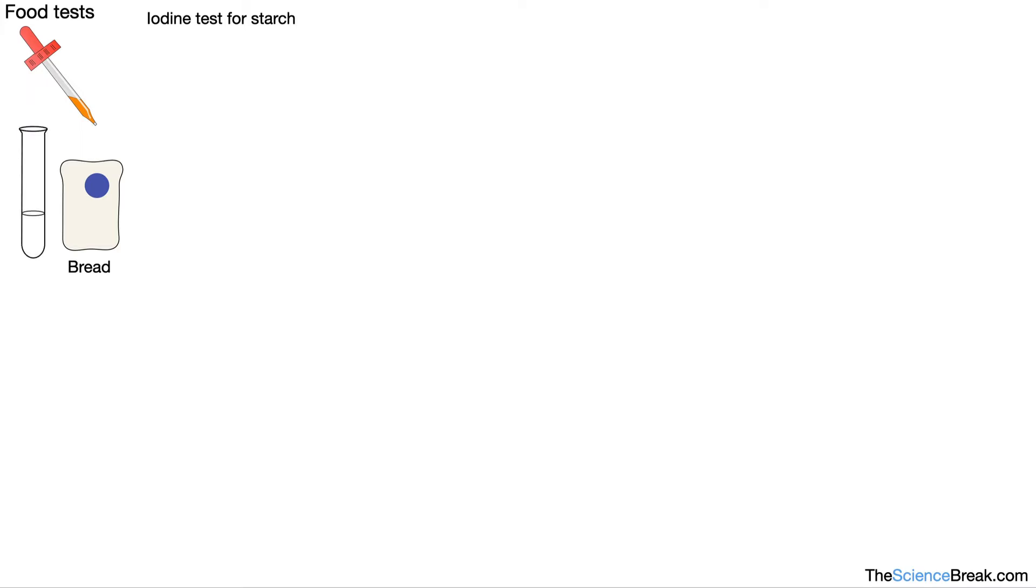We might also have a starch suspension, that's starch in some water. We can do the same test and see the same color change. So in order to do this, we add iodine solution which is orange to our sample. The color change from orange to blue-black shows that starch is present.